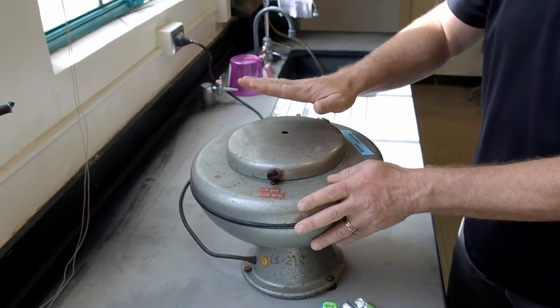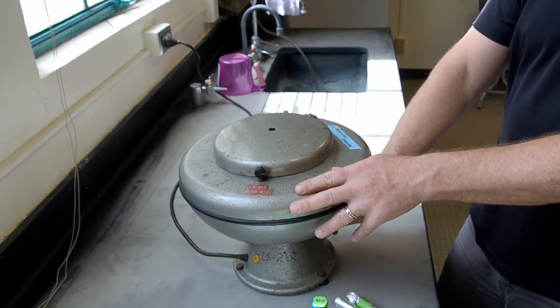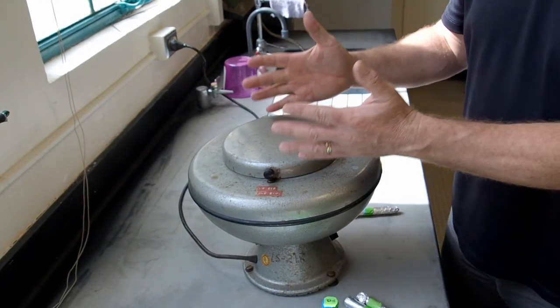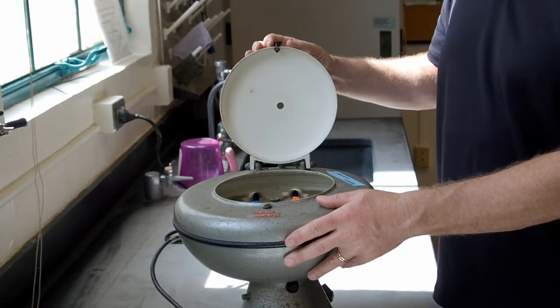We spin this for 2 to 3 minutes. That's plenty of time for the solids to be cast down to the bottom of these tubes, and then you can use the liquid for our analysis. Okay, centrifuge is done spinning.